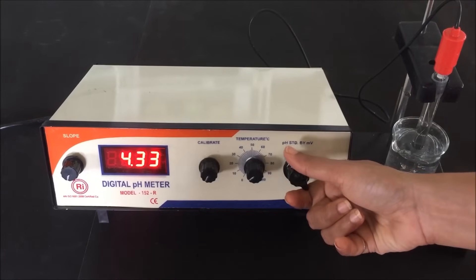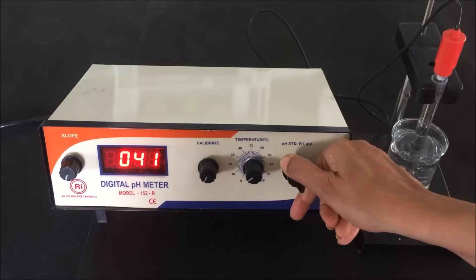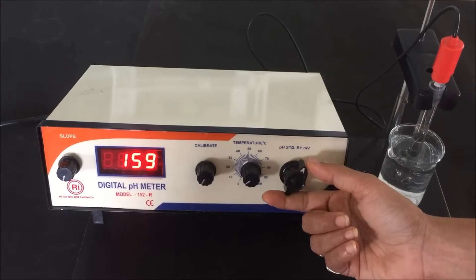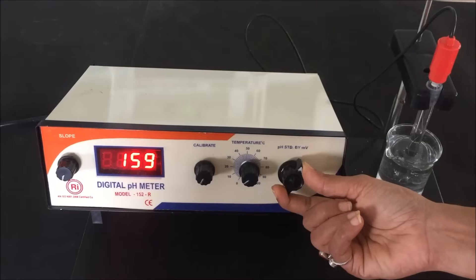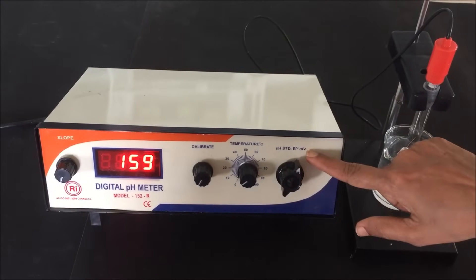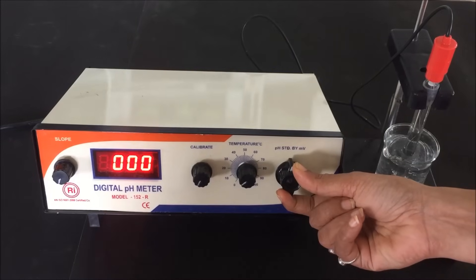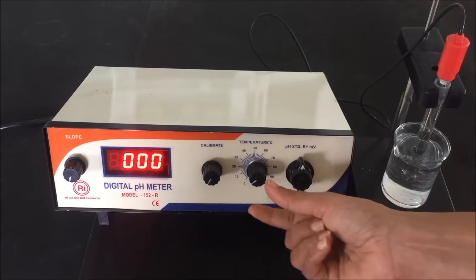If you want to measure the pH, rotate the knob to pH mode. Between measurements, set the knob to standby mode. If you want to measure the MV, rotate the knob to MV mode. We have to select the mode as per the measurement. The right side is MV mode and the left side is pH mode. Always return the knob to standby mode between measurements.